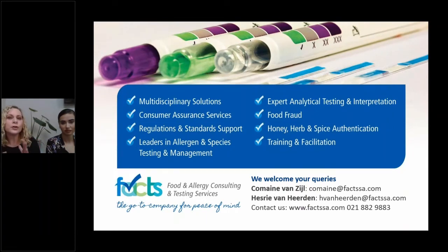So it all goes back to doing risk assessment. You need to determine what contamination is going to happen, which allergens you are actually concerned about, on which lines it is going to happen, and which allergens you need to effectively control, clean for, and test for. Absolutely. Nosaseko has a similar question, and I think she's asking specifically in relation to which kit would be suitable for them. I'm sure that you guys will engage with all of the delegates individually afterwards.